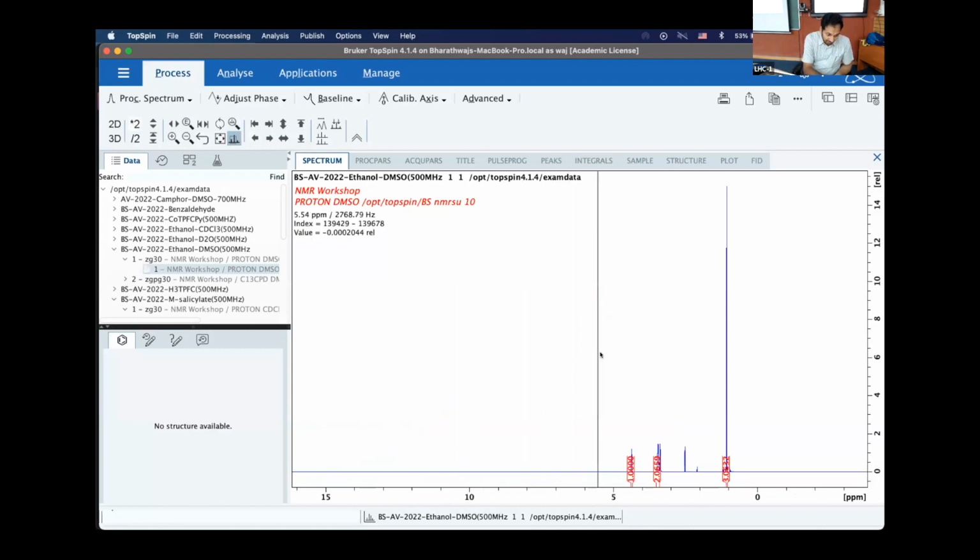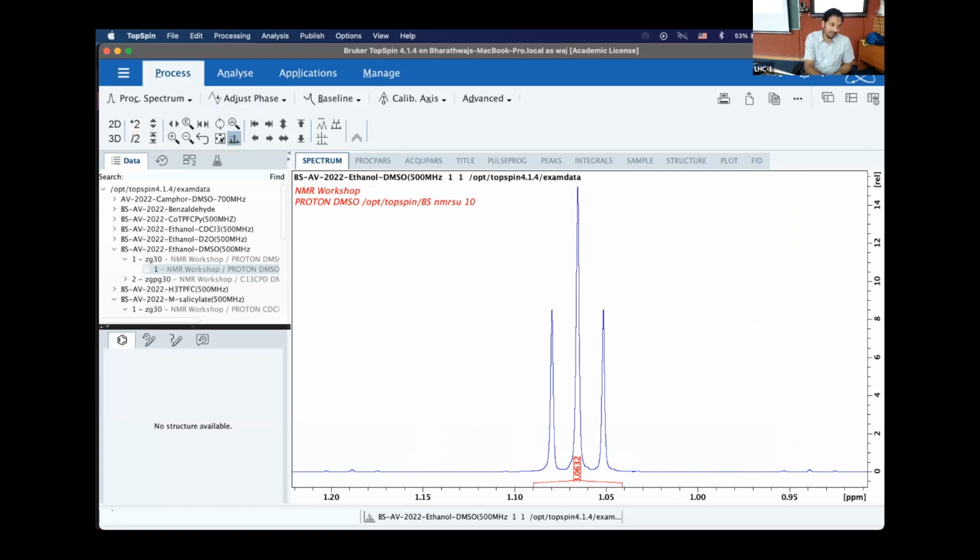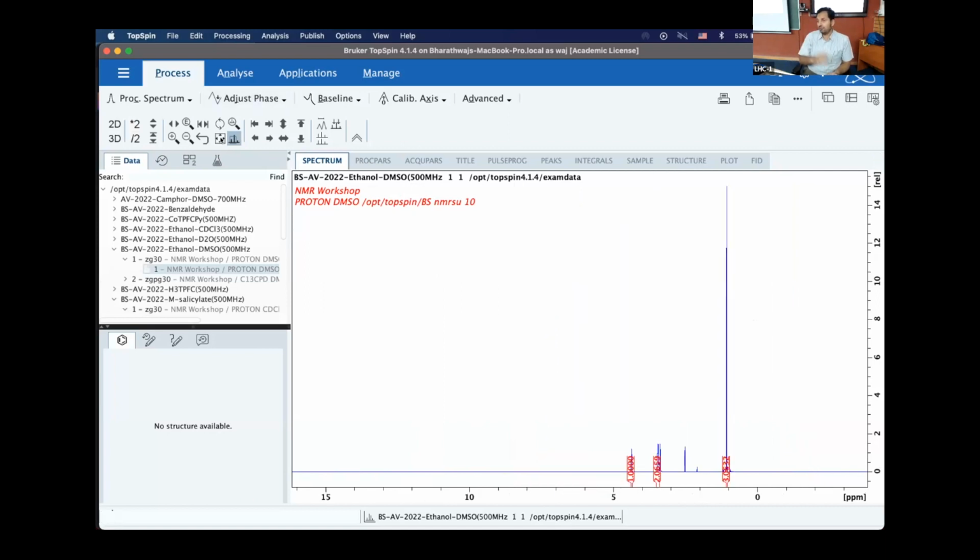And if you pay close attention yet again, if the D1 of the experiment is carefully set, you are able to see the hydroxyl proton is integrated to 1, the methylene proton is integrated to about 2.06, and the methyl proton is integrated to about 3.06. That is a little bit of 3% error or even 2% error that's existing. That's largely because the hydroxyl proton has an error. Even here, the hydroxyl proton will exchange a little bit with the residual water, resulting in the error.